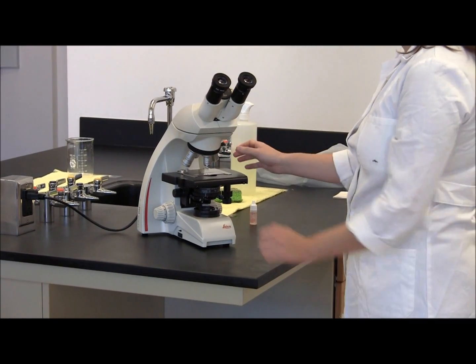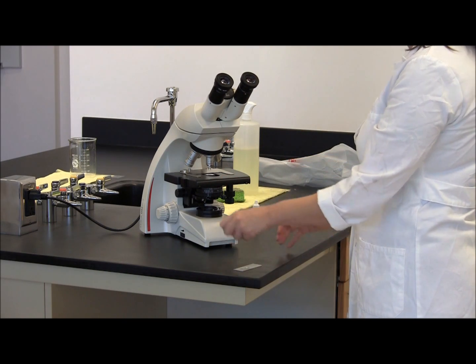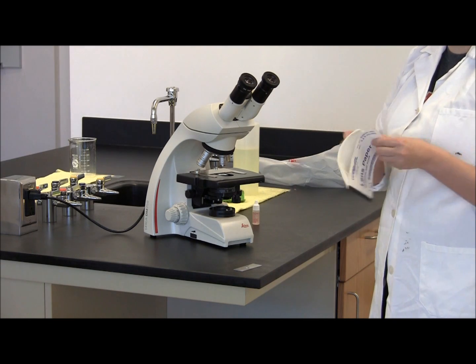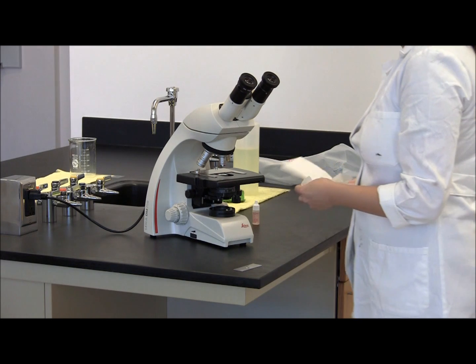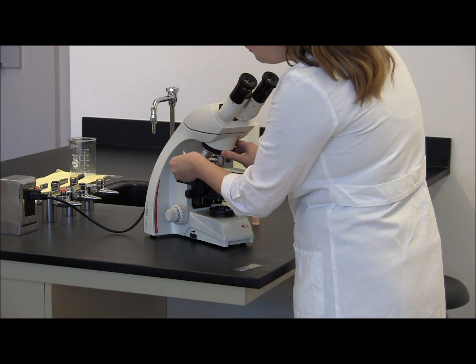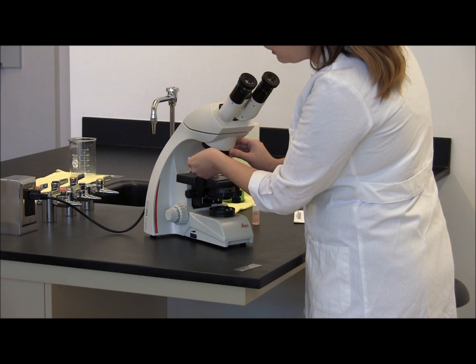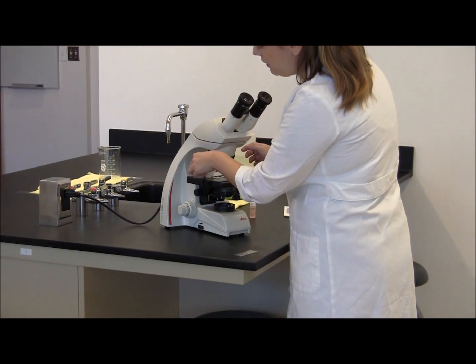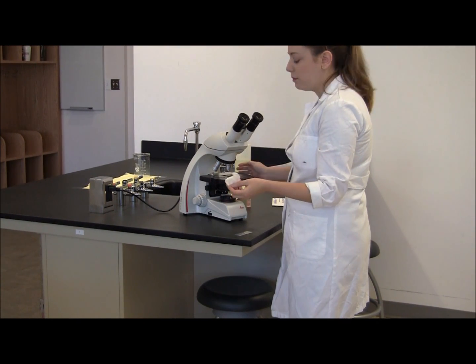The next thing we want to do is clean the microscope. Once you're done viewing your specimen, you'll gently remove your microscope slide, and using lens paper that's located in your drawer, you only need to tear off 1 sheet, and we're just going to remove the oil from the 100x objective. Be careful that once you have oil on your lens paper that you don't touch it to any of the other objectives. And you just want to clean this objective until you don't see any more oil on your lens paper.